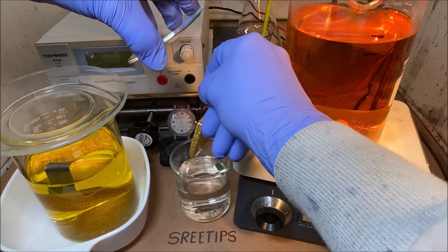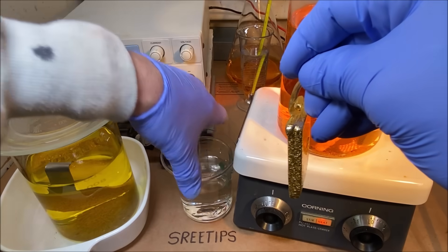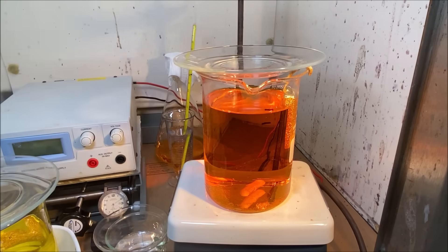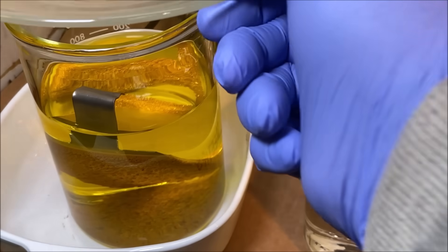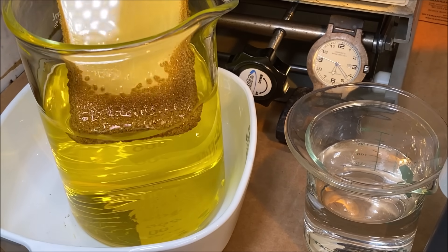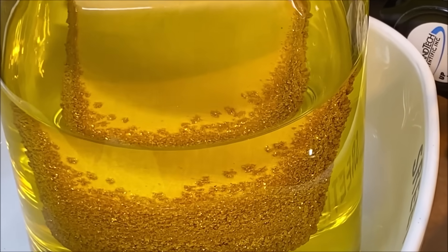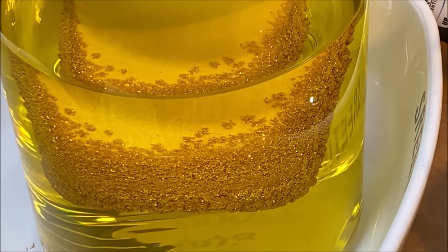We just took it all apart in our last video, so let's see what happens here if we can get this thing squared away. Put the anode back in here, and let's have a look at this cathode. I didn't get to show you the back of this thing — the back of it actually looks better than the front, as far as sparkly goes. See that? Look at that thing, man. Very nice, beautiful — pure gold crystal on the back.